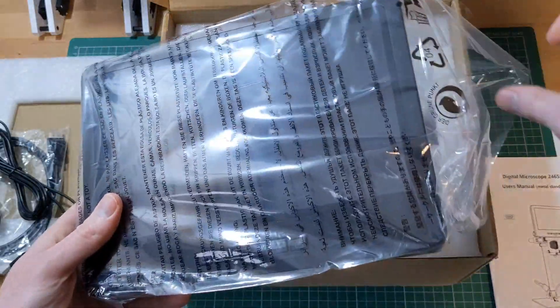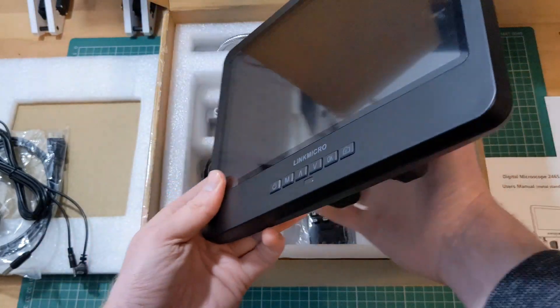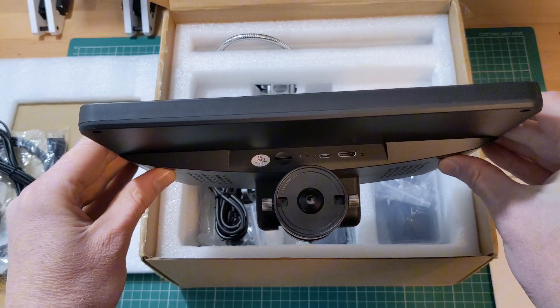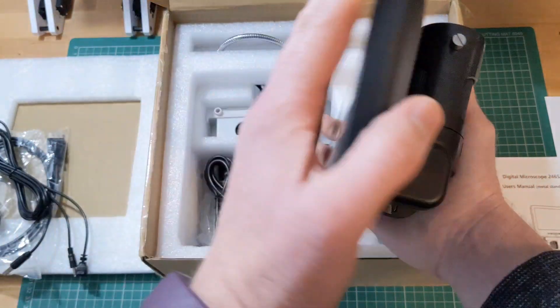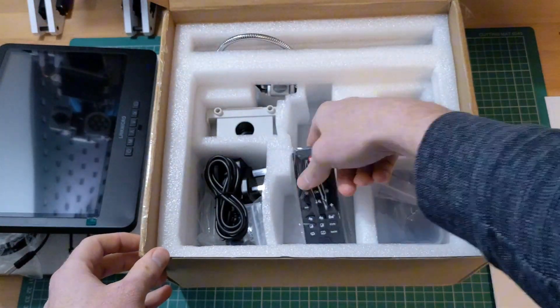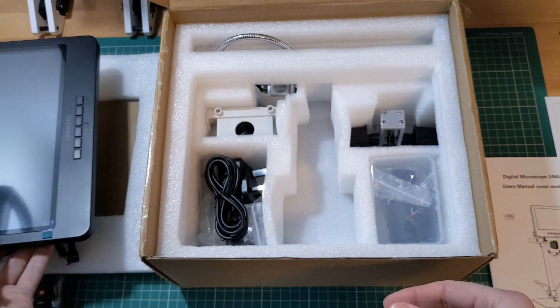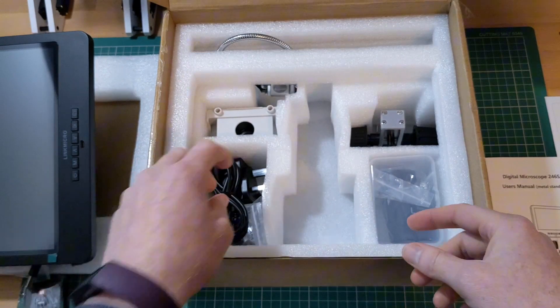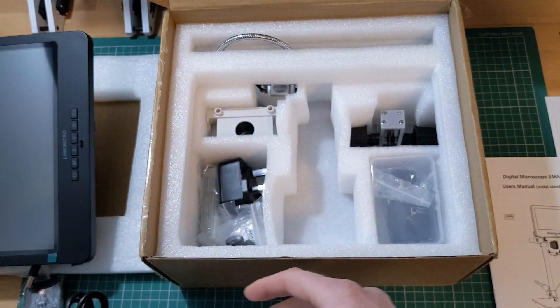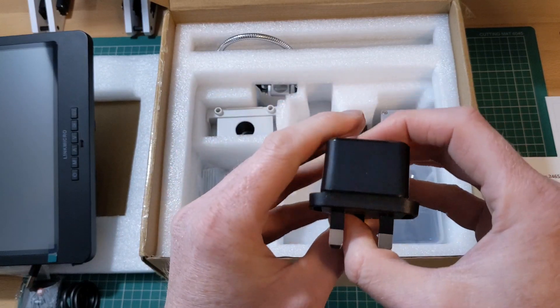The microscope itself is attached permanently to the monitor. An included remote control allows you to capture images and adjust various things without disturbing the microscope itself. There's a second cable that can be used to power the microscope only without the lights. The microscope can be powered via USB or with the included power adapter.